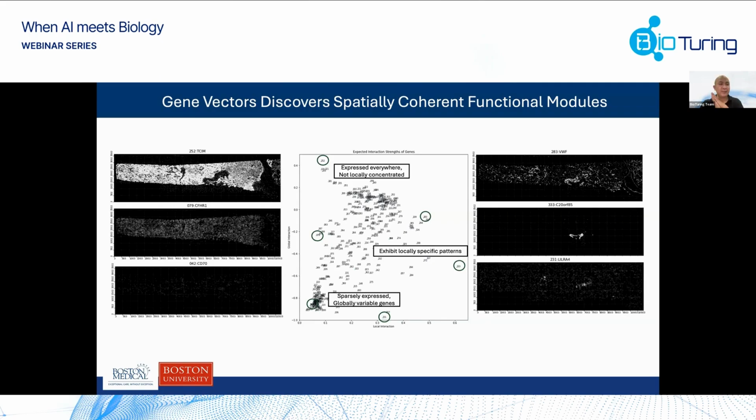Yeah, and we have another question related to the alignment. How do you integrate sequential sections in one Giotto object? Yeah, so you just have several sections, you align them, and that's it. Then you have an additional metadata tag, which is your Z stack.